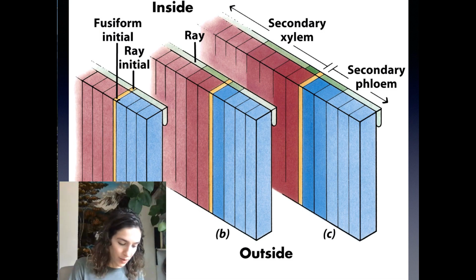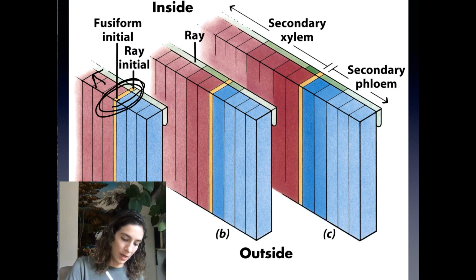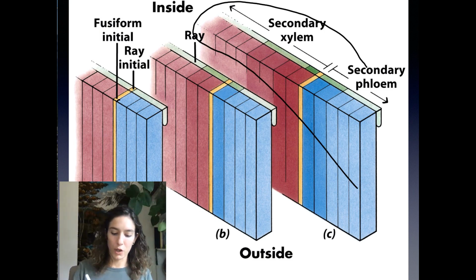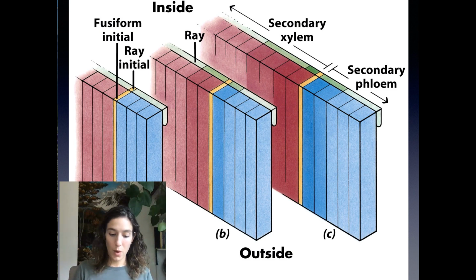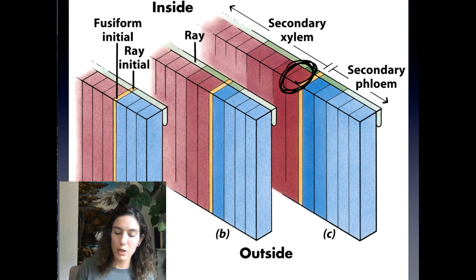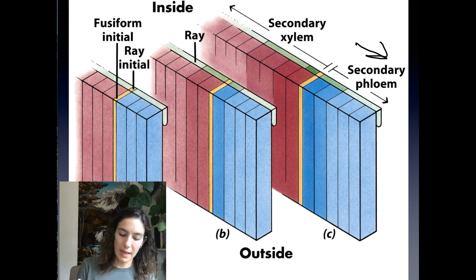So every time one of these cells divides, it is producing this secondary xylem to the in. And then as it gets older, again, these cells will divide and they will continue producing cells to the inside. So here, on this kind of oldest version of our little strip of cells, the oldest xylem that was produced earlier is back here. That means that this would be the youngest xylem. This is brand new xylem that was just formed from that vascular cambium. And then it's the same story, but to the outside with the phloem. The phloem is being added right here, right next to the vascular cambium.